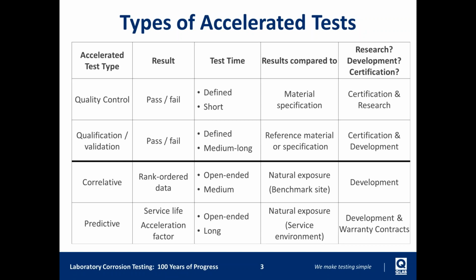Now, this can be run at benchmark sites for corrosion testing. Florida is often used, or a shoreline marine site can be used. But this could also be data that you've gathered from customer returns, if you have an idea of how your product lasts outdoors. What you're really looking for in these tests is to make sure that the results outdoors, the failure modes and mechanisms, match what you're seeing in the accelerated test.